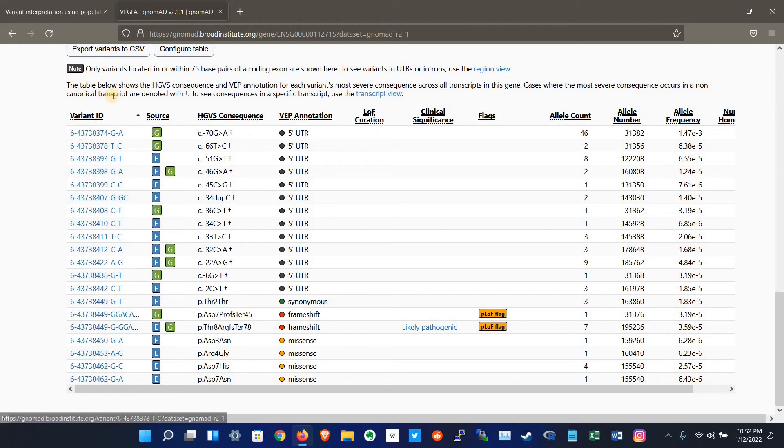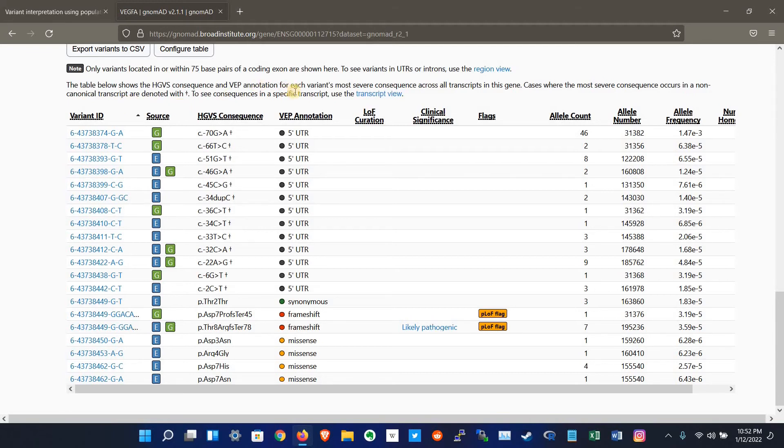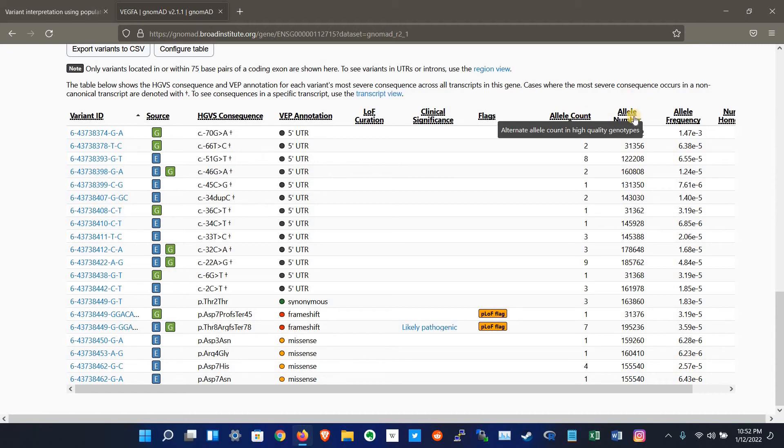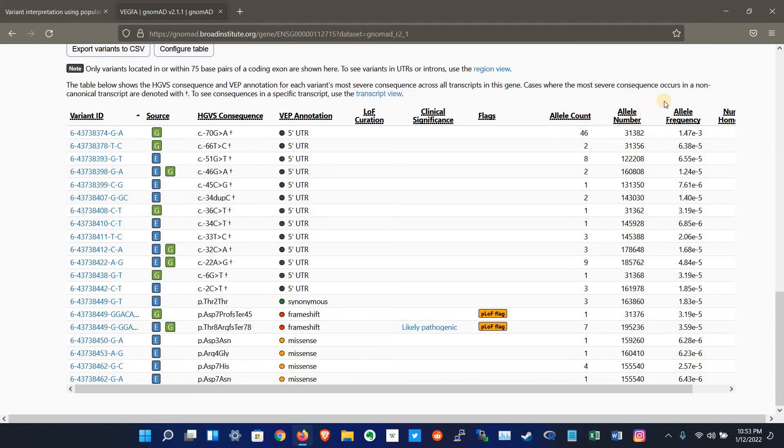The first thing is the ID, source, HGVS, consequences, VEP annotation, LOFTEE, and clinical significance, which is reported in ClinVar database with some flags. And allele count of each variant, allele number of each variant, and allele frequency of each variant.